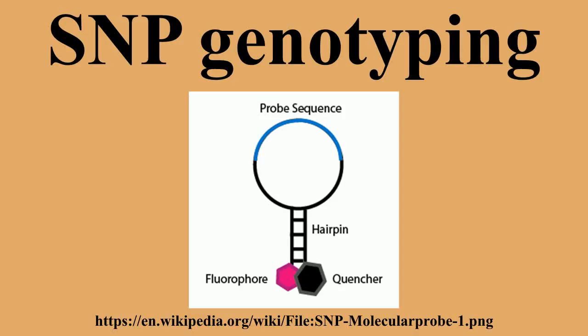In the first step, a genomic segment is amplified and attached to a bead through a PCR reaction with a biotinylated primer. In the second step, the amplified product is attached to a streptavidin column and washed with sodium hydroxide to remove the unbiotinylated strand. An allele-specific oligonucleotide is then added in the presence of a molecule that fluoresces when bound to double-stranded DNA. The intensity is then measured as temperature is increased until the melting temperature can be determined.